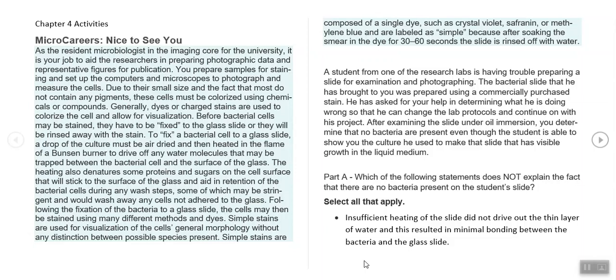Immunofluorescence is where we have a fluorescent dye that links to an antibody, and then the antibody-dye combination then binds to the target, and that allows us to see it and to make it visible. So that is the one other light microscope I do want you to know what happens there.